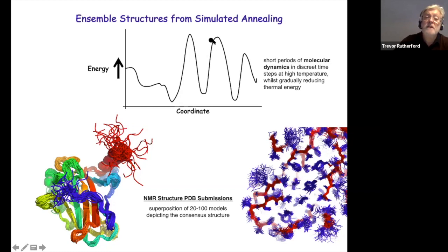So the way that we can increase confidence that we found the global minimum is we give the system enough energy to traverse all of these energy barriers, and then we slowly take out energy from the system, thermal energy, as a simulation. And slowly this system should converge down to the lowest energy point as we get down to zero kinetic energy, zero thermal energy. So how can you be sure that you've reached the global minimum?